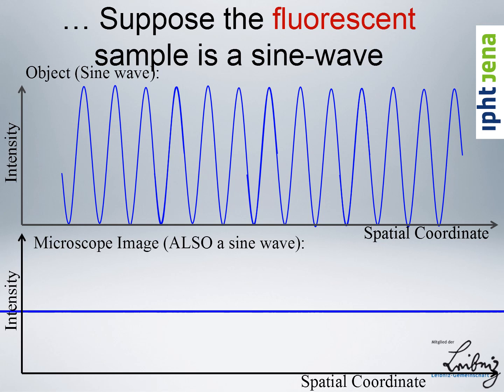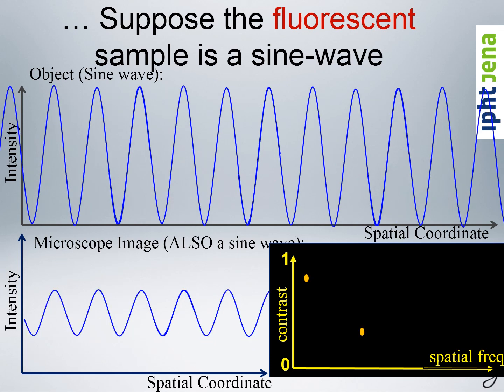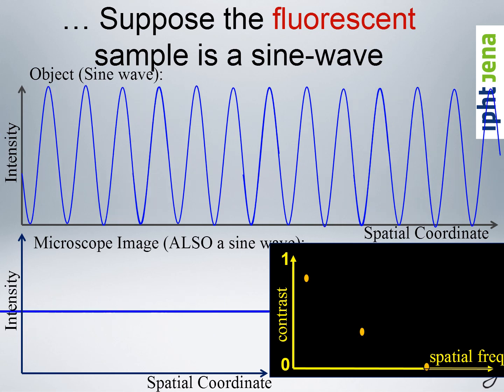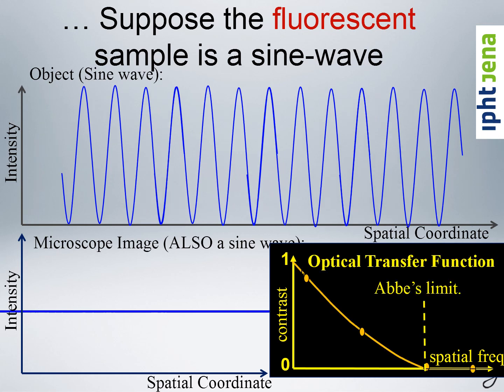So the same is shown in the next slide here, and you see a coarse sine wave, again a pretty good contrast. Smaller sine wave, less contrast, dimmed down like this here. Abbe limit, zero contrast. And higher frequency, also zero contrast. So in total, you have a transfer function that shows you now how much is transferred. So I think now you understand really what is the meaning of the optical transfer function.